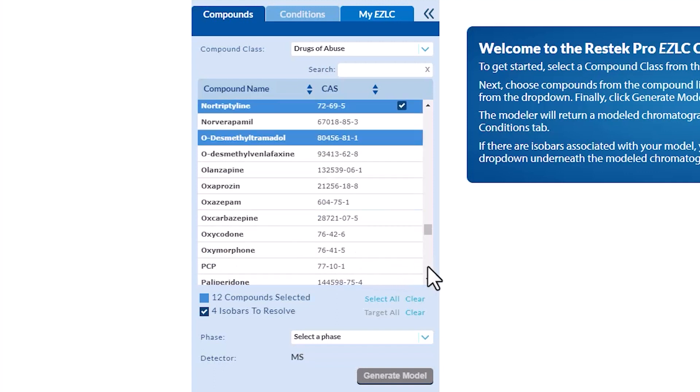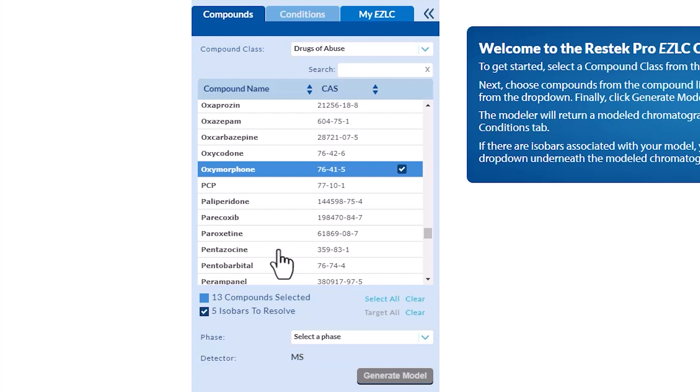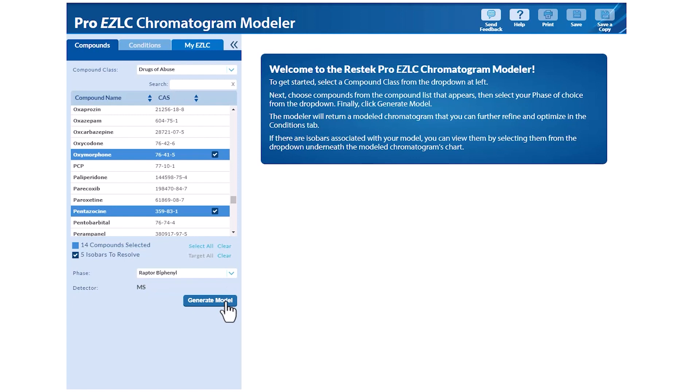After you have selected your compounds of interest, you need to choose which column or phase you would like to model the compounds on. Click the drop-down menu to select a phase. Here, we're selecting a Raptor biphenyl column and then click the Generate Model button.